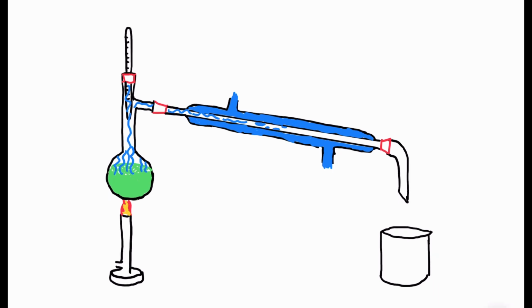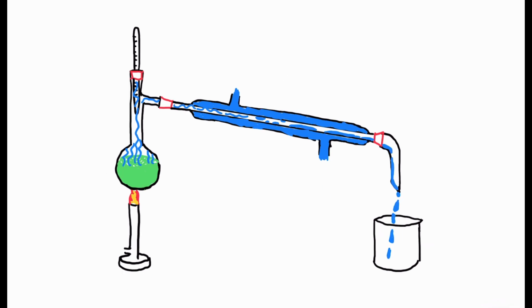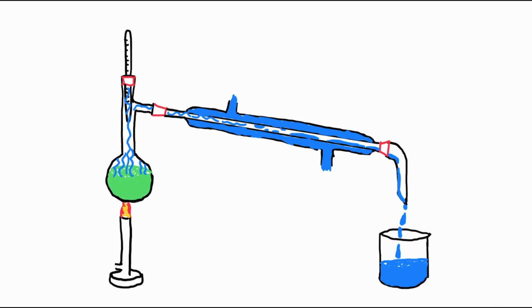Because the Liebig condenser continually has water entering and leaving it, it's kept very cold. Because the Liebig condenser is very cold compared to the hot water vapor, the hot water vapor begins to condense, turning back into a liquid in the Liebig condenser. The droplets of water go down the Liebig condenser because it's at an angle, and because of gravity they fall into the beaker where they are collected. And at the end we would have the water collected in the beaker, and the ink would remain in the round bottom flask.